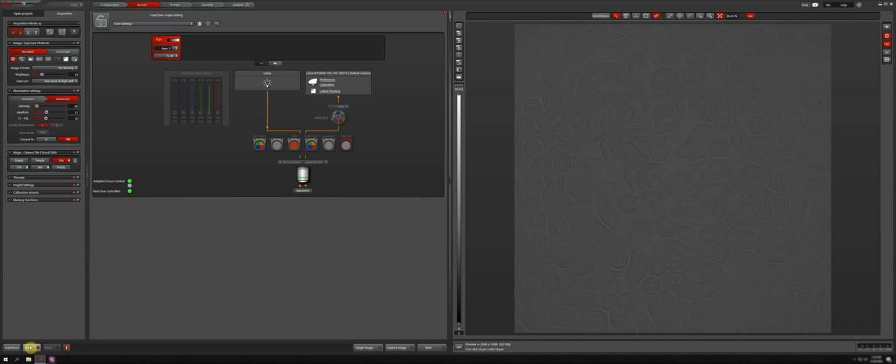The system that I will be using is a fully motorized DMI-8 with two 20x objectives and one 40x objective. The sample that we're currently looking at is a kidney slice in regular transmitted light bright field. The shading correction is however not limited to inverted systems, but can also work with other camera based systems such as upright systems, for instance, and also in stereo microscopes.